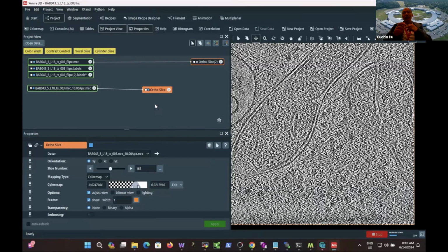Yeah, have you ever seen the DRP1 rings? We haven't seen DRP1 rings. We've seen things we think might be, but they're not there at most of our CLEM sites, including DRP1 CLEM. Okay, good to know. We think it's probably because it's very transient. DRP1 comes on and off the membrane all the time, and it only forms the ring at the very end. So our suspicion is that the downside of being a snapshot technique is that if your snapshot is not at the exact right time, you're not going to get it. This is an active area of research for multiple labs right now. I would guess that progress will be made on that.